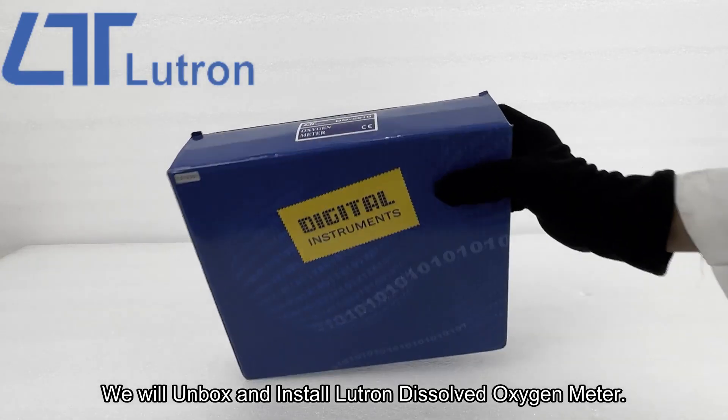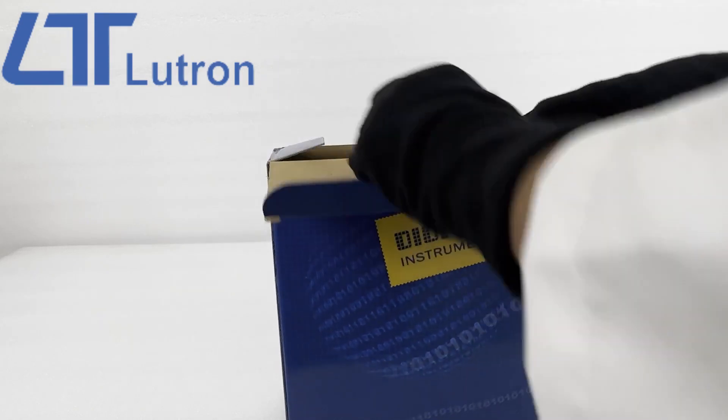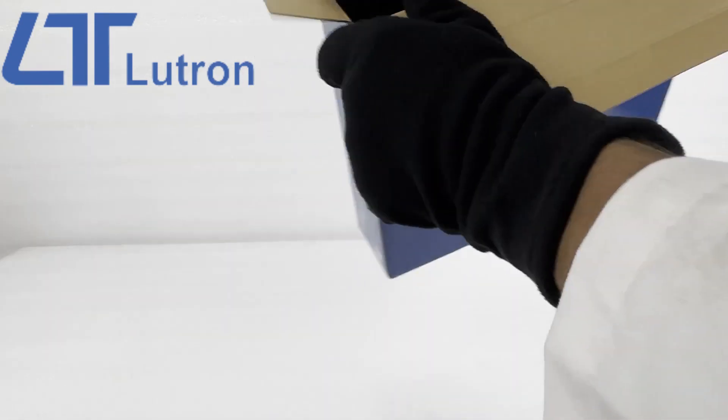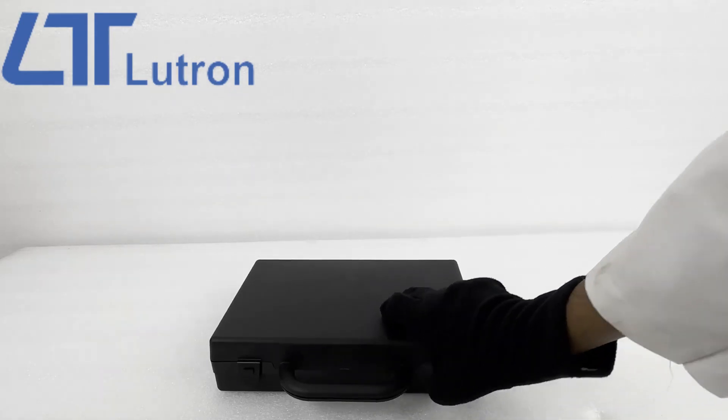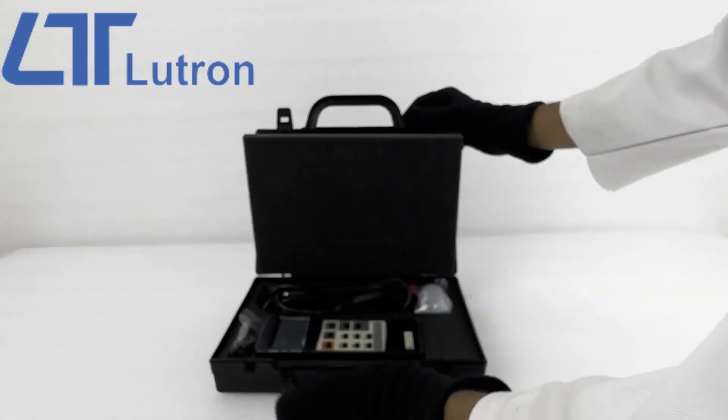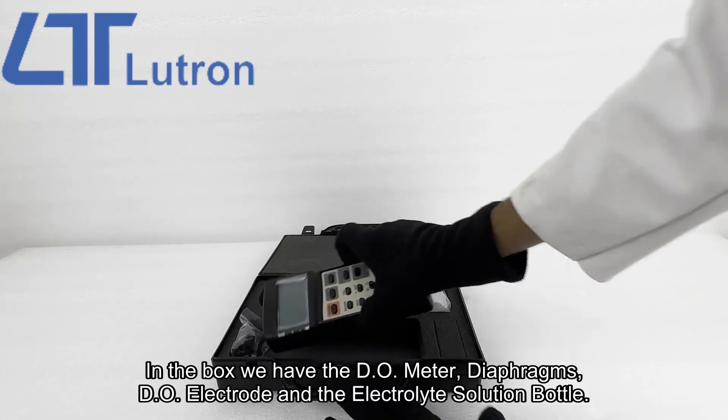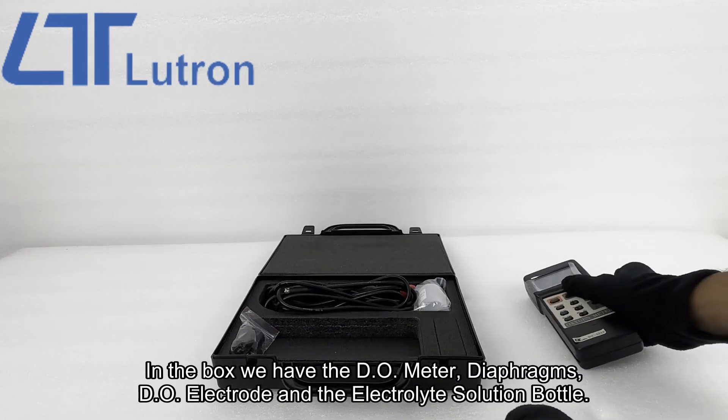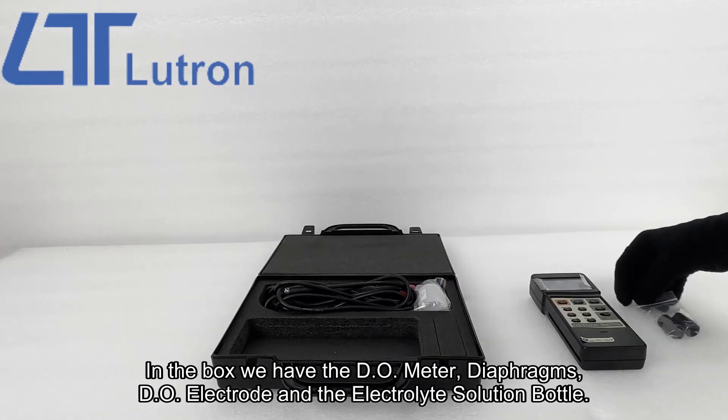We will unbox and install the Lutron dissolved oxygen meter. In the box we have the DO meter, diaphragms, DO electrode, and the electrolyte solution bottle.